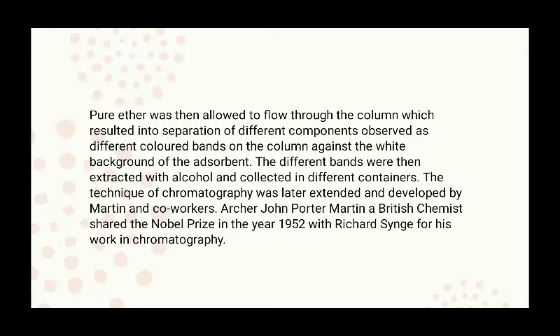Pure ether was then allowed to flow through the column, which resulted in separation of different components observed as different colored bands on the column against the white background of the adsorbent. The different bands were then extracted with alcohol and collected in different containers.